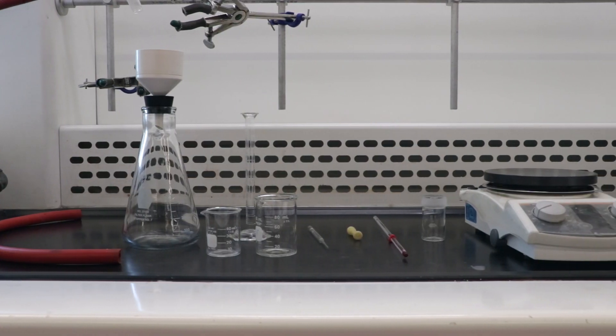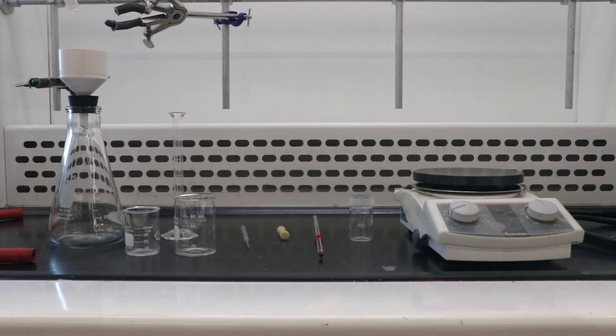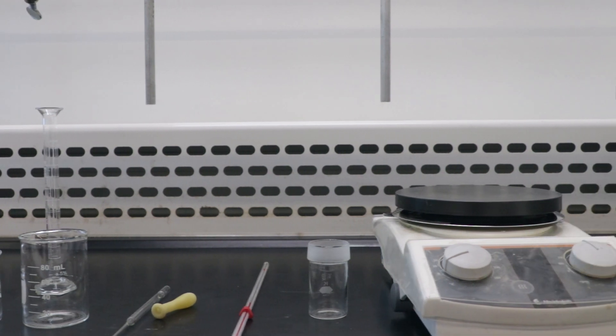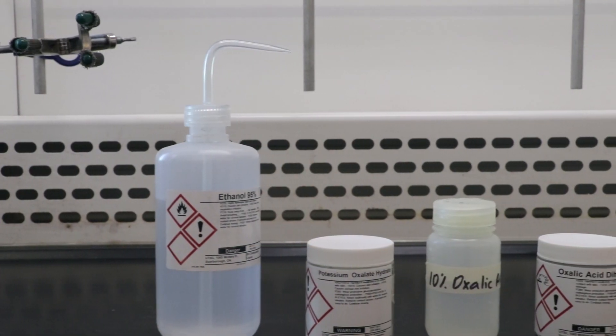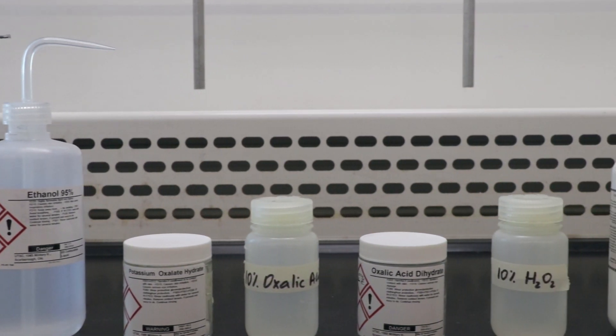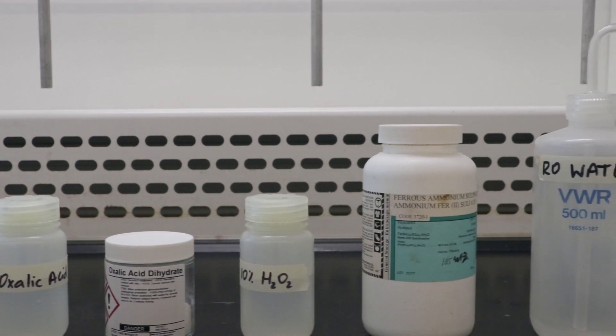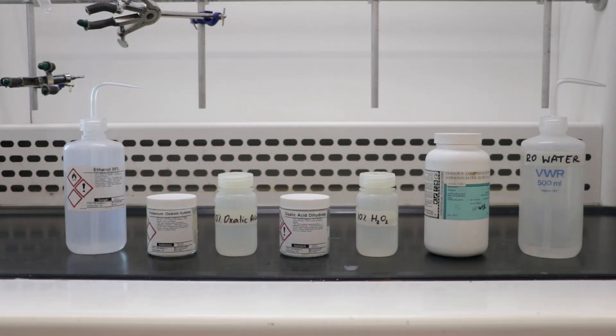This is the apparatus you'll need for this lab. The thermometer can be found at the front of the lab. Everything else can be found in your drawer. All of the solid chemicals you need to weigh out can be found near the top loading balances. Oxalic acid, hydrogen peroxide, and ethanol can be found in the TA fume hood.